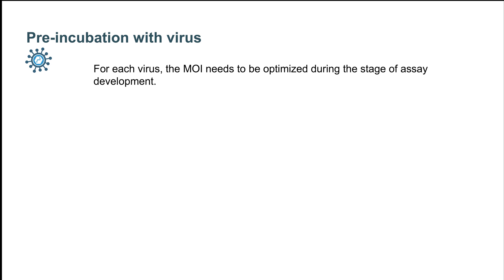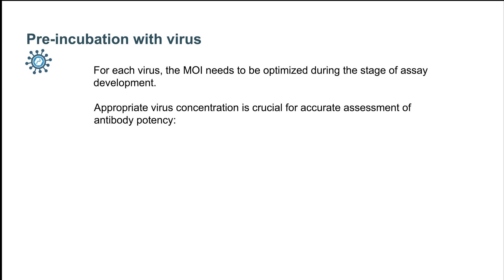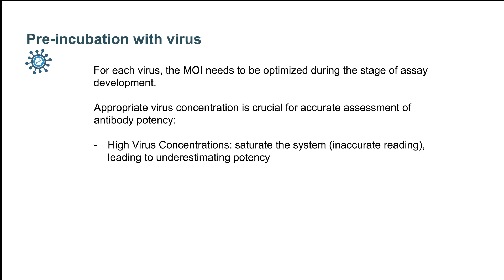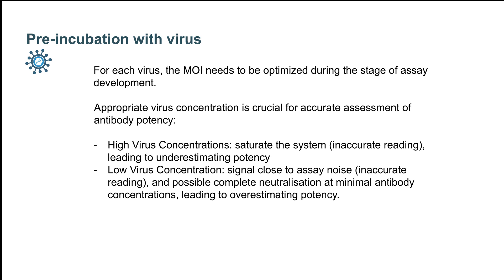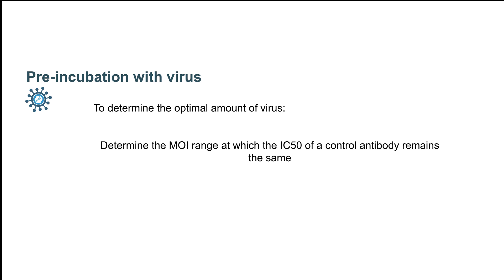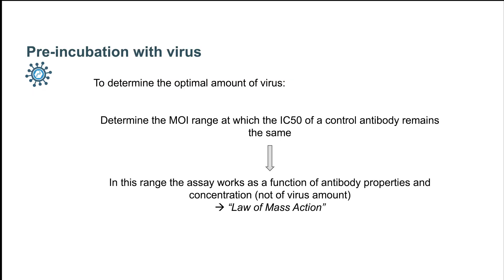For each virus, the MOI must be optimized during the stage of assay development, as the amount of virus is critical for accurate assessment of antibody potency. Too much virus can saturate the system, compromising readability and potentially underestimating antibody potency. Too little virus and signal may be too close to the assay noise, leading to inaccurate reading or, potentially, overestimation of potency. To identify the sweet spot, different concentrations of virus within the assay linear range should be tested. The range of MOIs at which the IC50 values obtained for the same control remain unchanged constitute the sweet spot.